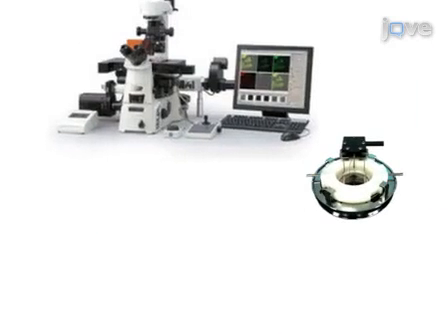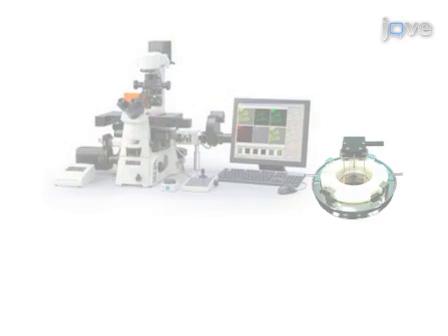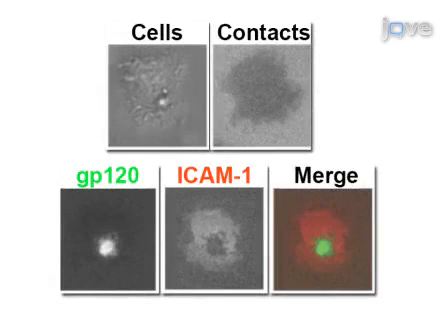Then, using total internal reflection fluorescence, or TIRF microscopy, acquire images of signaling molecules within the synapse-forming cells. Analyze the TIRF images to delineate the localization of active signaling molecules with respect to the virological synapse structure.